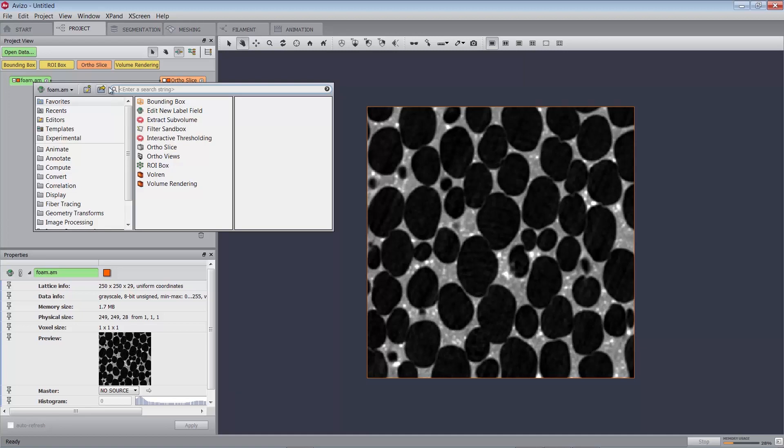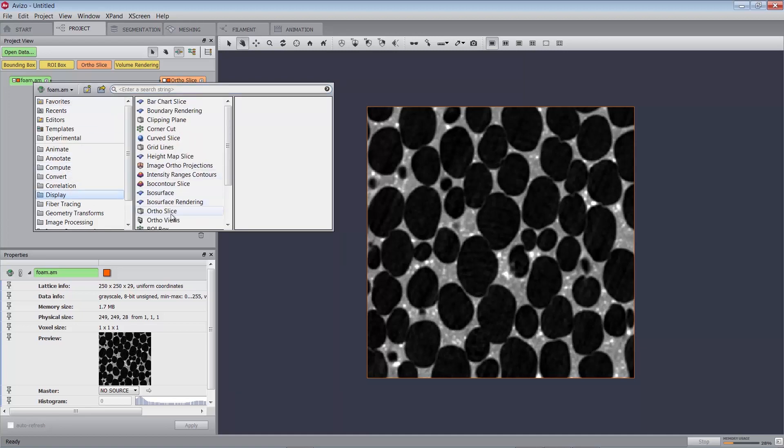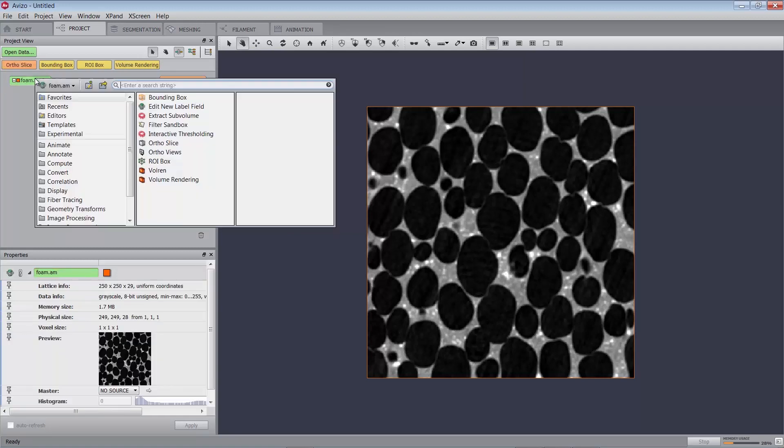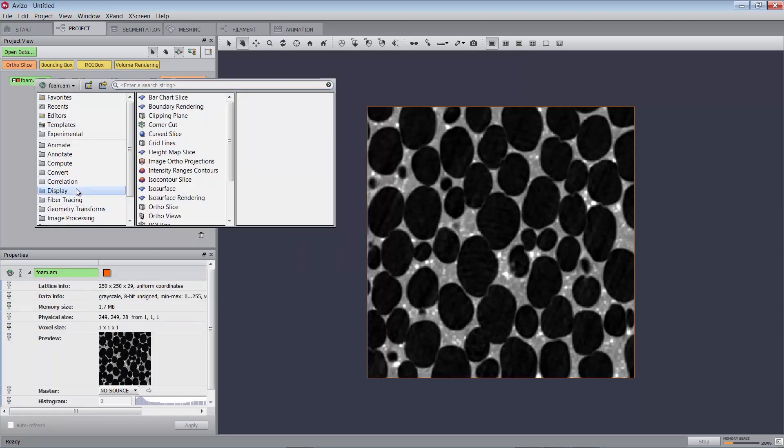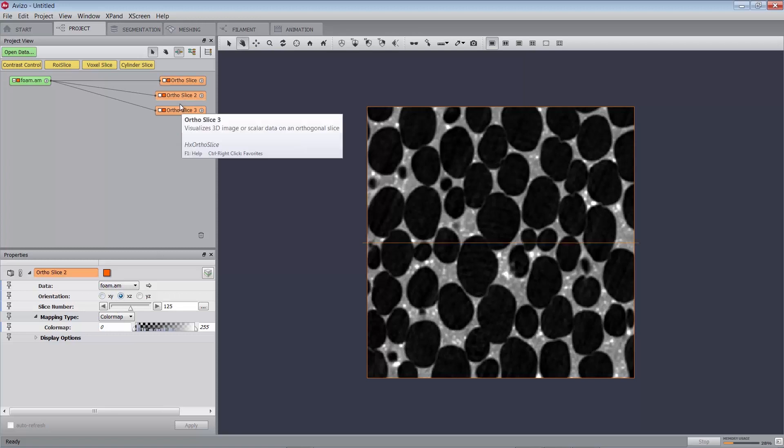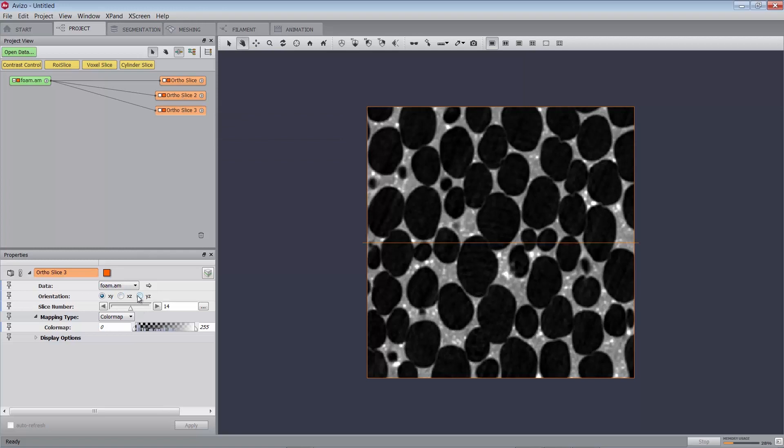Attach three ortho slices to these data. In the properties panel of the second ortho slice, select the XZ orientation and the YZ orientation in the third ortho slice.